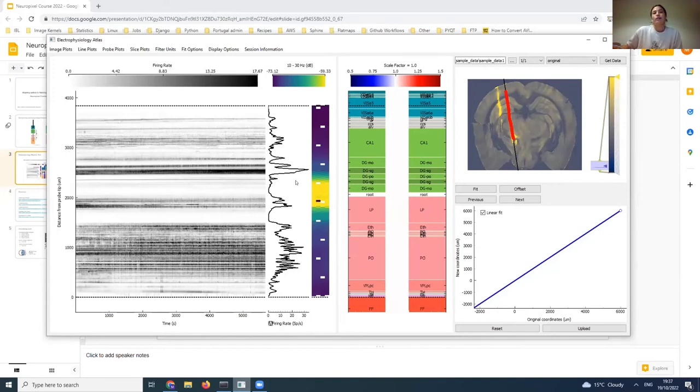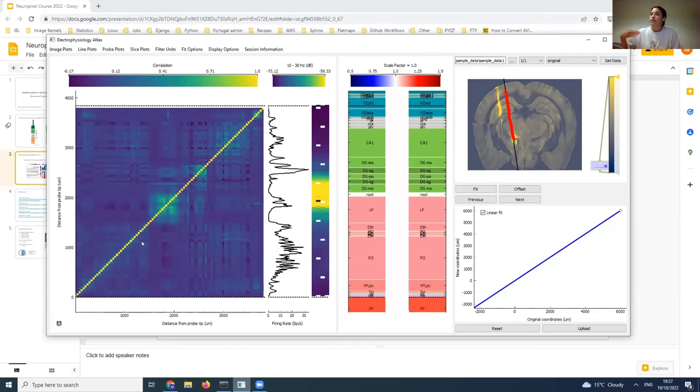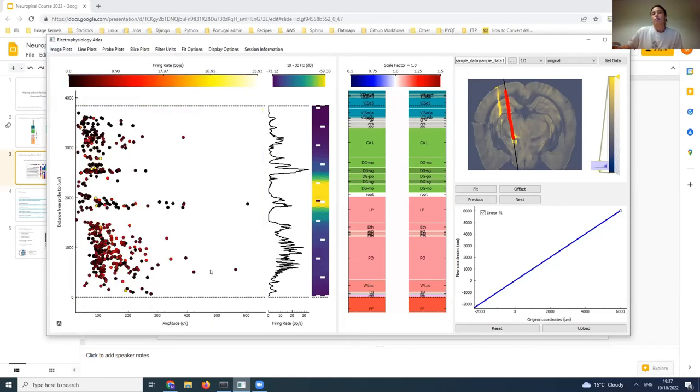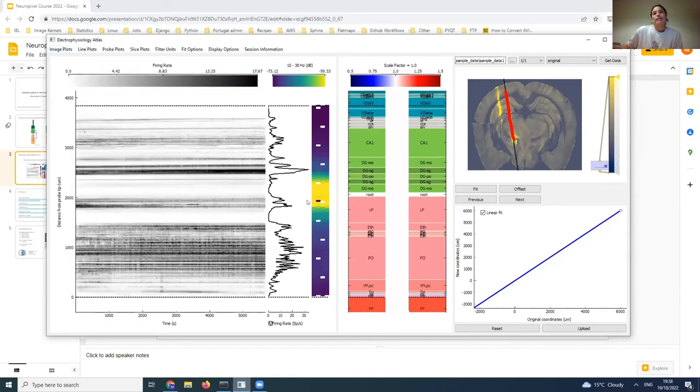In addition to these plots, there's a number of different displays that you can see, and they can all be found in these dropdown menus. For example, we can look at the cross-correlation of activity across depth, or we can look at the individual cluster plots and see where the clusters are and look at their amplitude along the x-axis and the color is their firing rate.